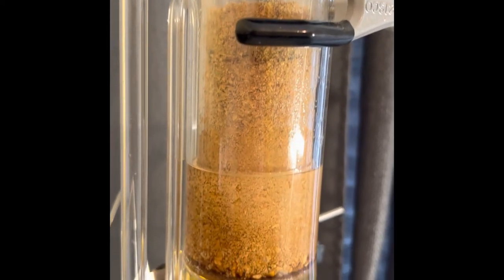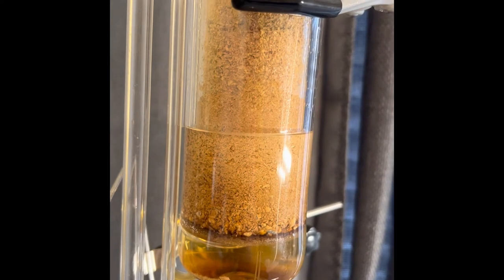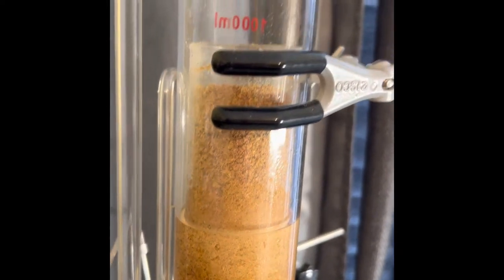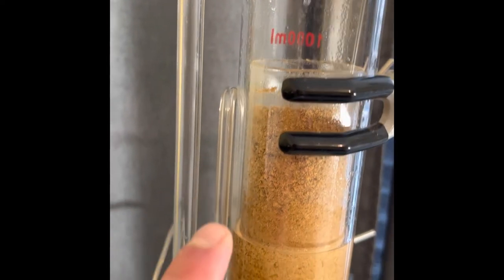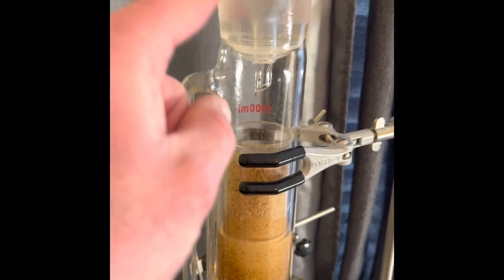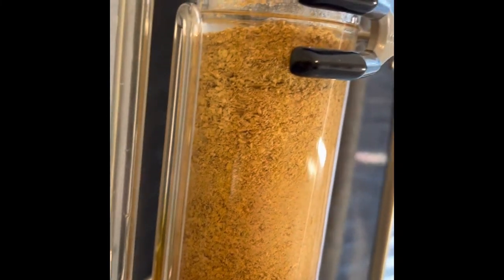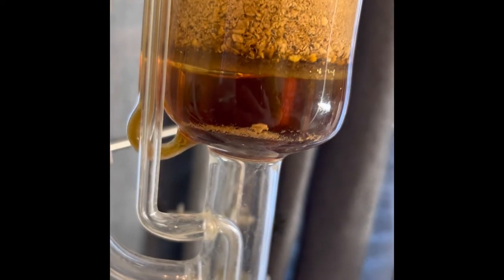So once this starts filling up and the organic material, in this case red reishi, is fully saturated, it'll start filling up in this main chamber. And once it reaches a point about here, right to the edge of that thimble, it'll siphon down through here, back into here, and the whole process starts over again. So as you can see now, the solvent, ethyl alcohol, has fully filled the thimble. Got some good looking reishi extract down here with the first pull.